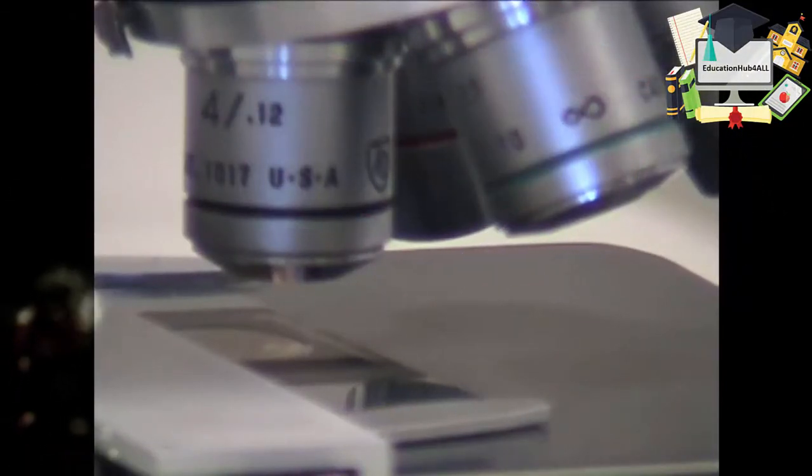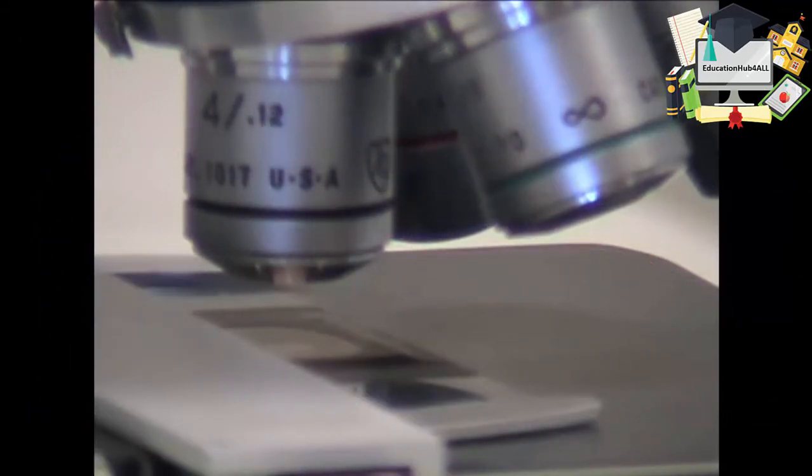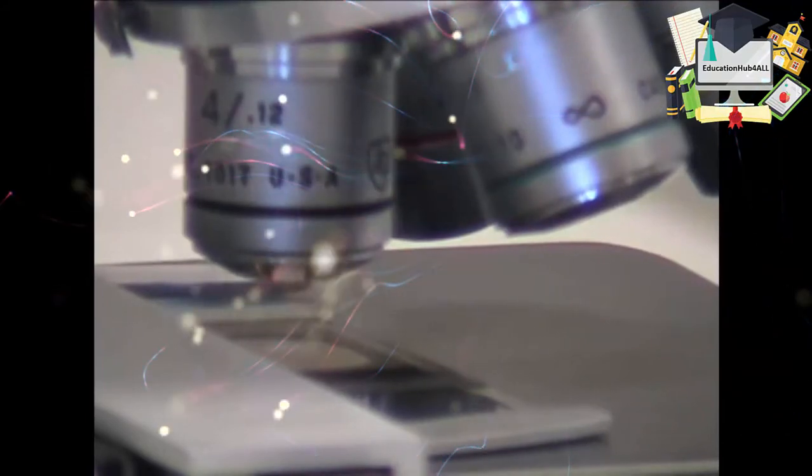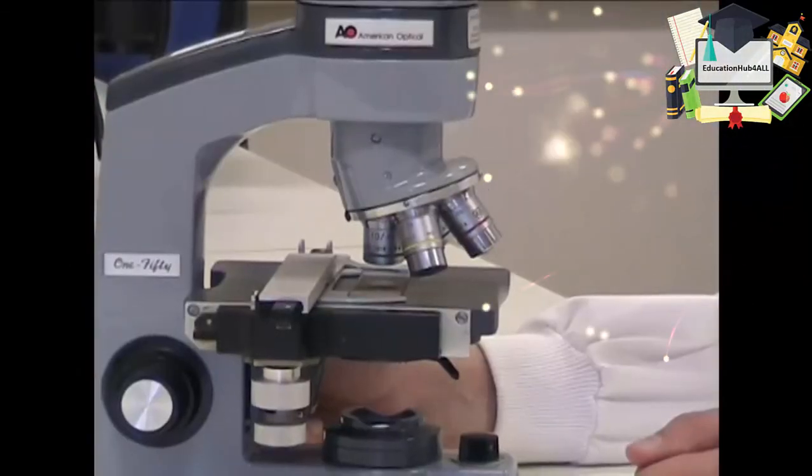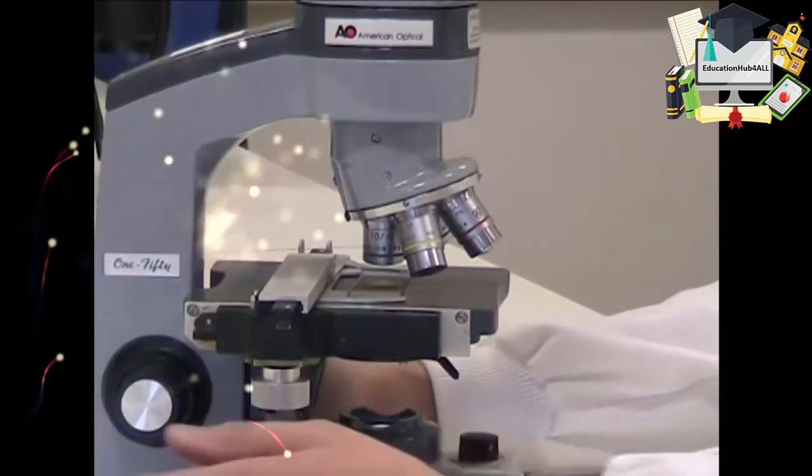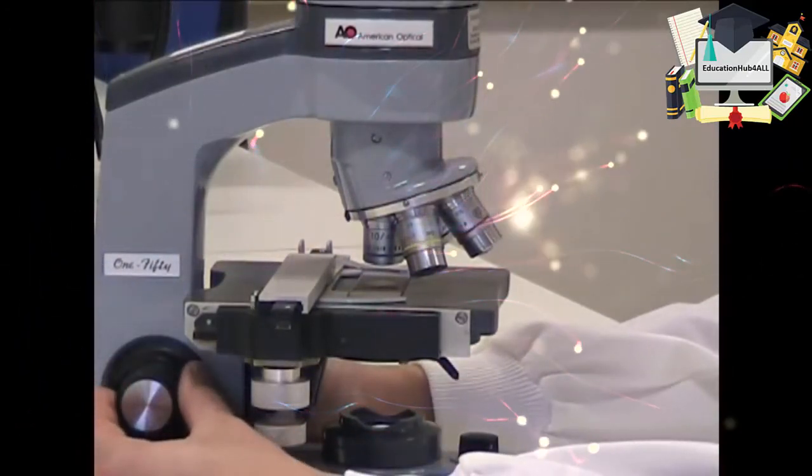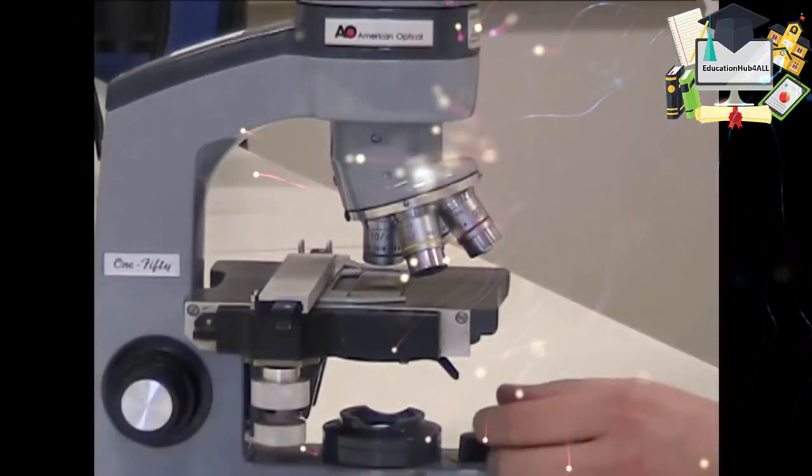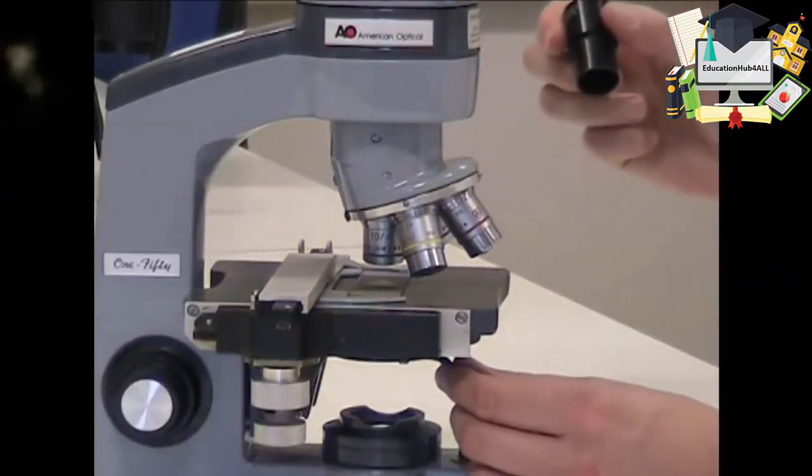If you want to move to a higher magnification, first of all use the stage controls to move the feature of interest to the centre of the field of view. Then move the objective lens around, in this case to the 10x lens. Each time you change magnification you'll need to slightly readjust the fine focus and also readjust the iris diaphragm.